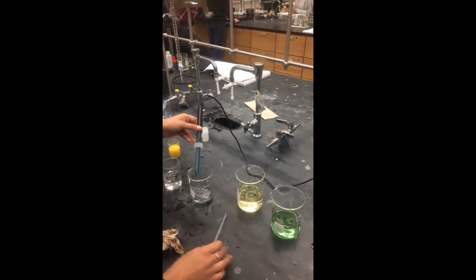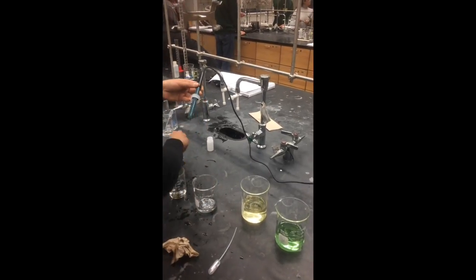For the rest of this video, we continue to calibrate and use pH meters. Please enjoy.